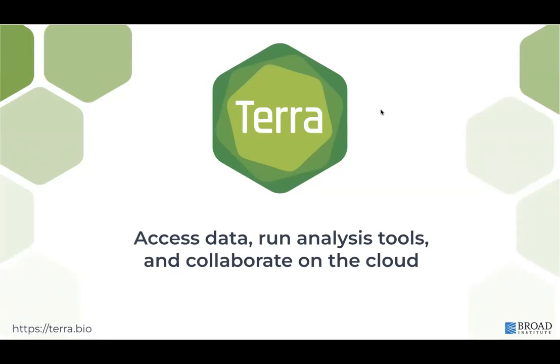And then I want to ask one other question. What data types are the attendees of this workshop most interested in analyzing or visualizing? Great. Lots of whole genome, GWAS, transcriptomics. I saw an I don't know in there somewhere.